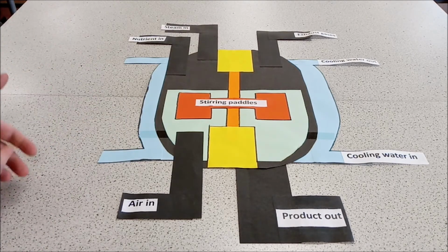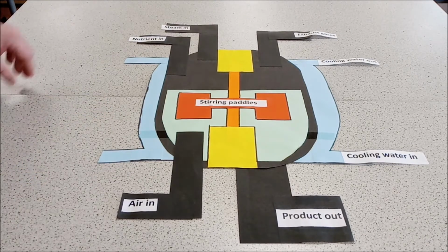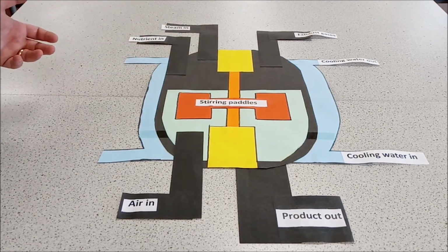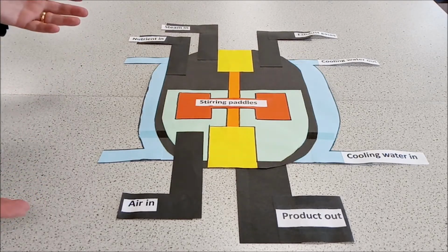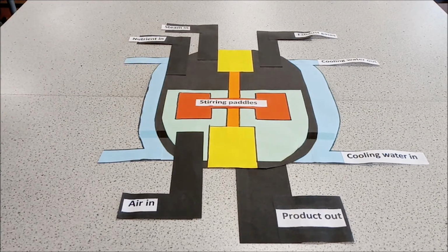But as you're going through, get students to think and get the information out of them, why the different parts are there. So start off with saying, you've got your mycoprotein in there. Start off with what nutrients are going in. Get them to think about what nutrients they need for respiration, because it's the respiration which allows the growth to take place. Then you can move on to the fact that respiration leads to excess heat.